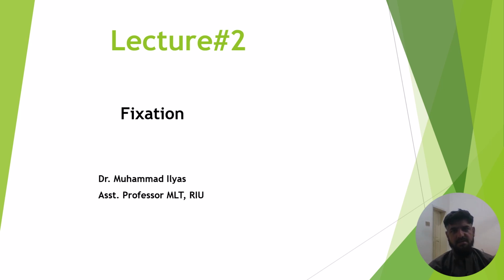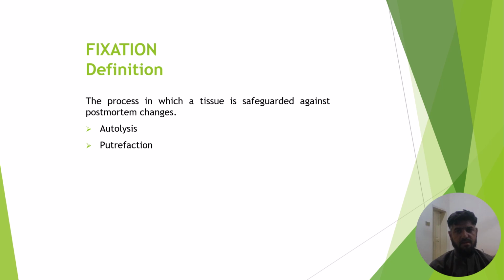This is the second lecture of Histotechnique, in which we will discuss the most important topic of Histotechnique, that is fixation. So fixation by definition is the process in which a tissue is safeguarded against postmortem changes, that is autolysis and putrefaction.